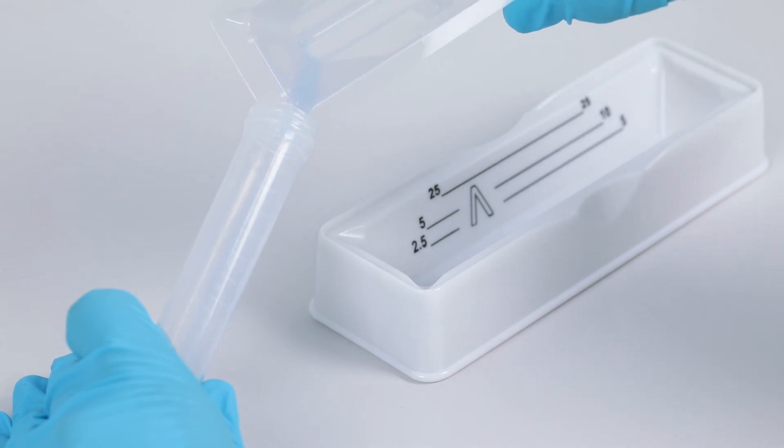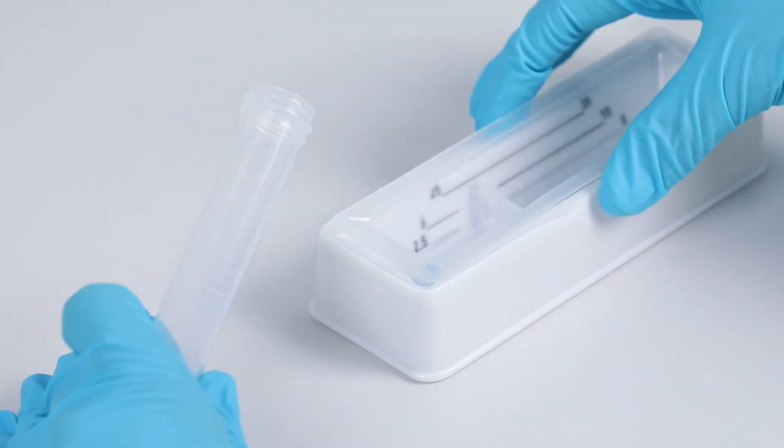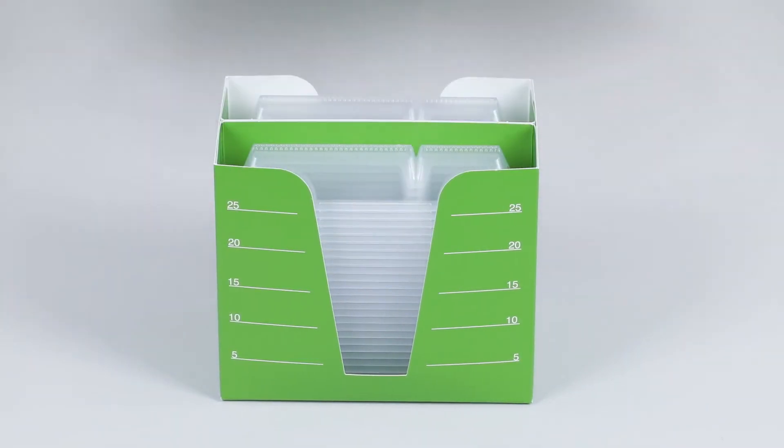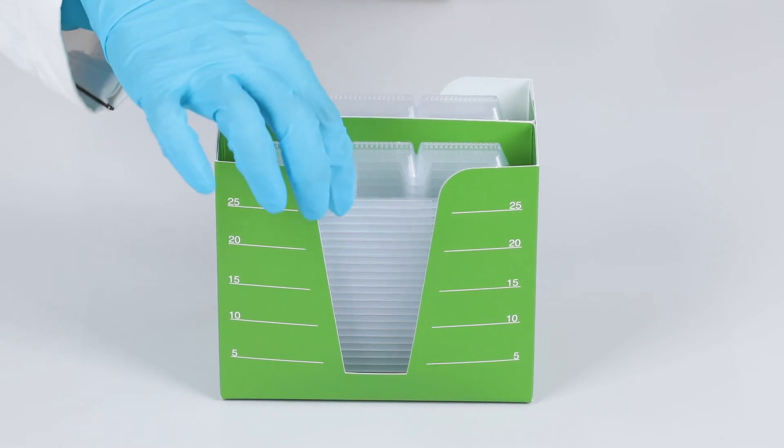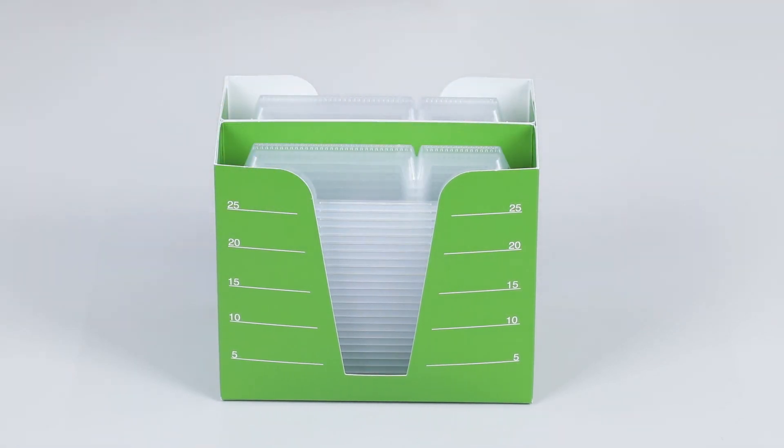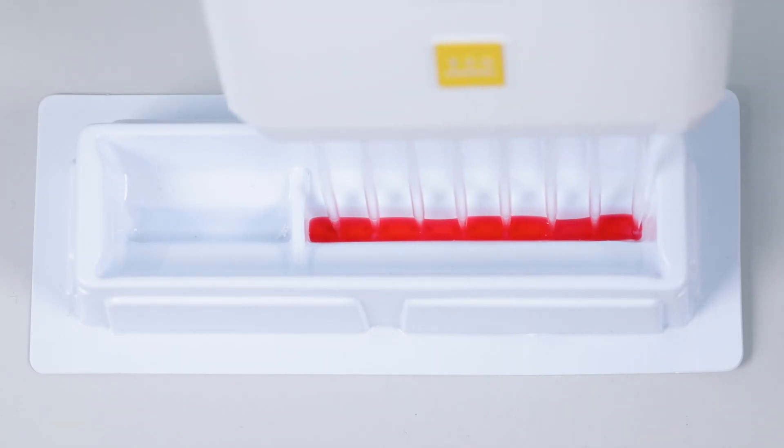A space-saving stackable design significantly reduces storage requirements, and there's less material waste than with other commercially available reagent reservoirs. The days of wasting precious sample and expensive master mix are finally over.